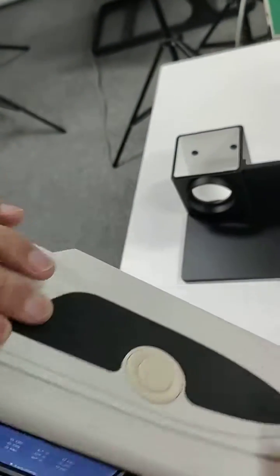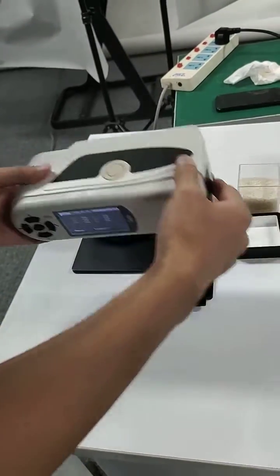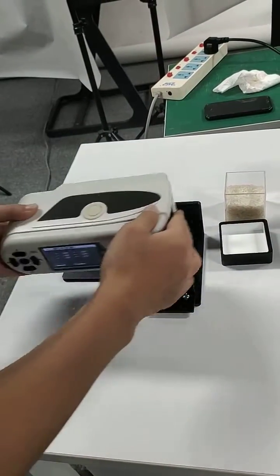After we calibrate it, we install the instrument to the universal test component, like this.